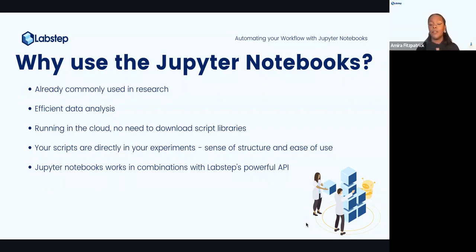Cool. And I guess before we can crack on, could you just elaborate for people that maybe won't have too much knowledge on what an API is? Because I think that's really the key into understanding Jupyter Notebooks right now. Yeah, so an API is a very standard thing. It's something that exists in all cloud software. It is essentially just a way to interact with the software.